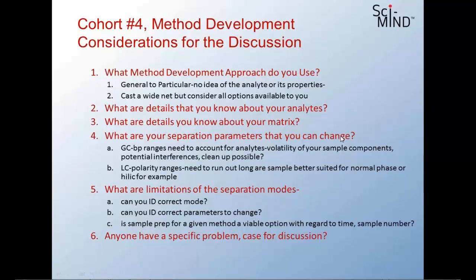And there are other places you could go. If you buy, for example, an introductory UPLC book, they try to explain the Van Deemter equation and things like that. It goes over the theory very nicely and covers it. Yeah, they might go to some of the instrument manufacturers as well. They might have some videos that they could use. Yeah, absolutely. Also, I don't know if Paul Boswell's on the line, but he's got a website that's really useful where you can play around with a variety of different separations. He has it for LC and GC. Really nice to play around with. And I know that Jeff has that information already included in Sci-Mind.